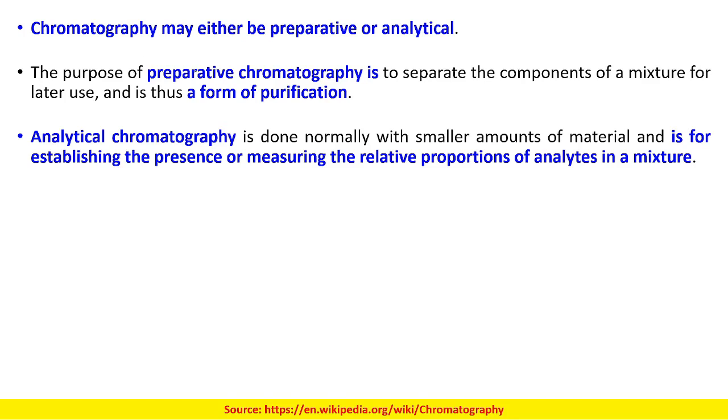So chromatography may be of two types. It may be either preparative chromatography or analytical chromatography. Preparative chromatography is used on a large scale, and since it is performed at a large scale, it is mainly used for the purification of a specific compound.